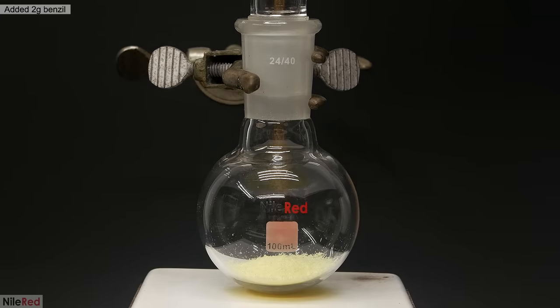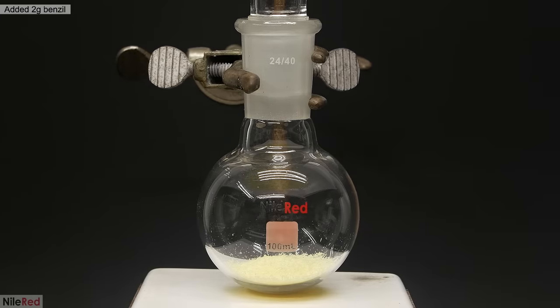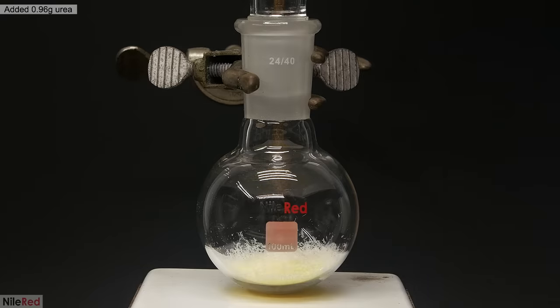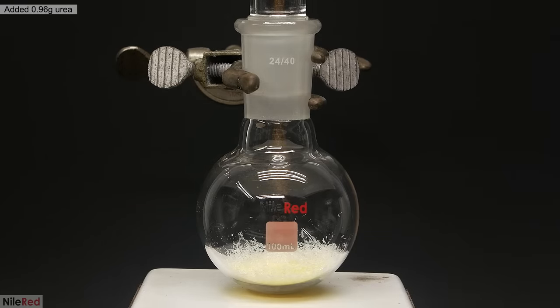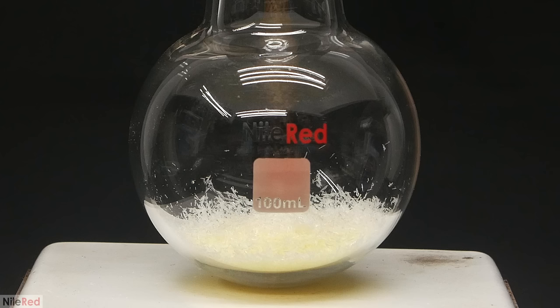So, into the flask, I dumped 2 grams of the benzil that I just made. Then on top of this, I added 0.96 grams of urea. The reason I only used 2 grams of benzil, instead of the full 4.2 that I just made, was because I wanted to use less urea. This reaction isn't very efficient with it, and I only recovered several grams from my urine, so I have to be sparing.